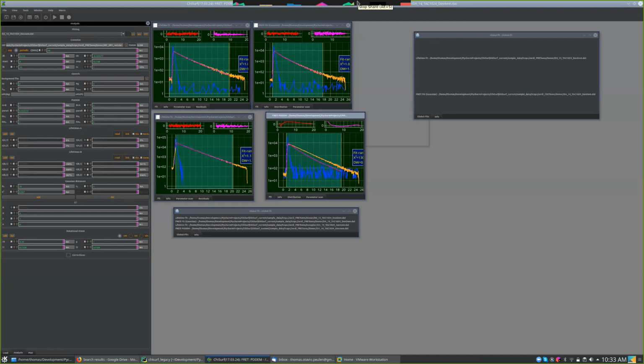Well, there's also the possibility that you continue fitting this until you reach it. I can try to fiddle around with that, because right now this is mainly fiddling with the data till it fits.